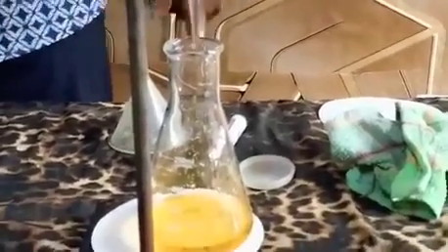So it's going slowly, as you can see. That's the first one we're doing. So you have to take it slowly, slowly as you watch the color. Any color change reflects on the white paper. So your focus should be on the white paper.